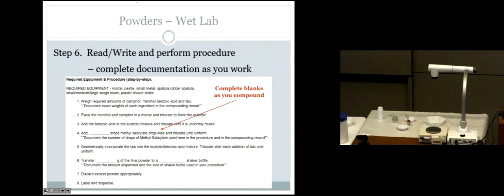Here's a range. You don't have to write this in the margins or somewhere else. You're trying to get rid of the camphor smell. So take a big whiff of it and then add 2 drops. Start with 2 drops of the methyl salicylate and then sniff it again. If you're happy and you like it and it seems reasonable, you're done. And some people love camphor, so they're happy. So you can stop there too.